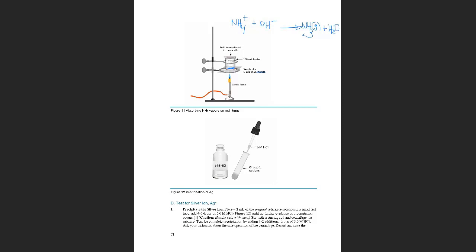How do you know that you have these vapors here that go up? First of all, the smell of ammonia, this is ammonia. And this one is ammonium.